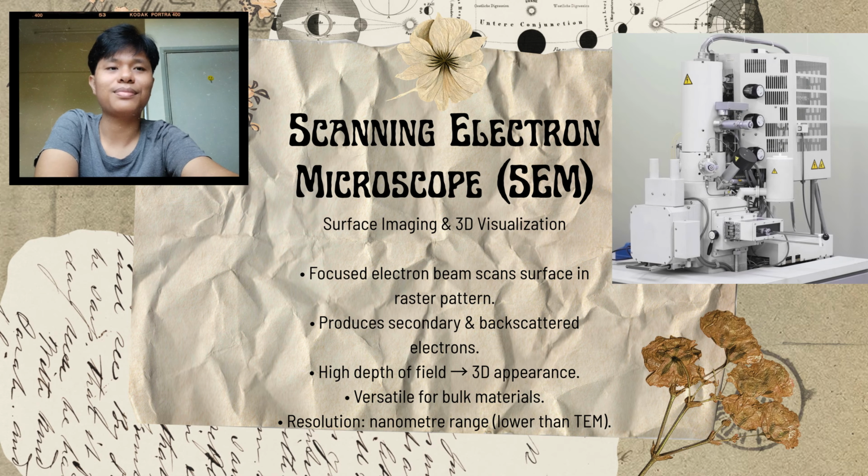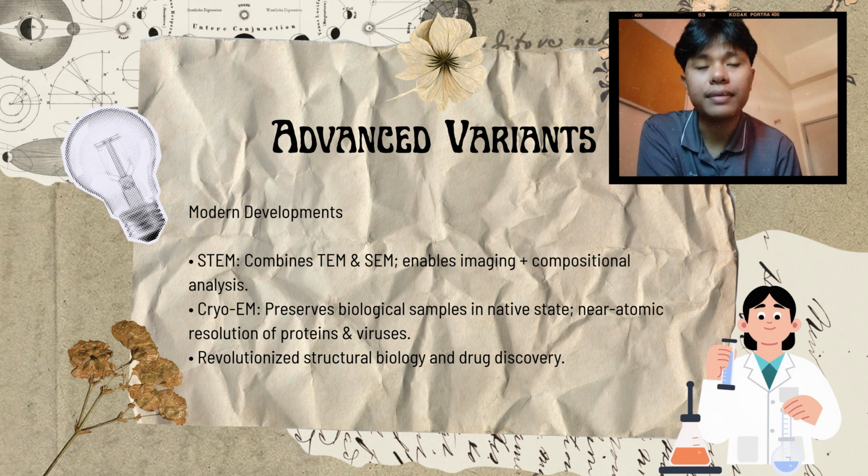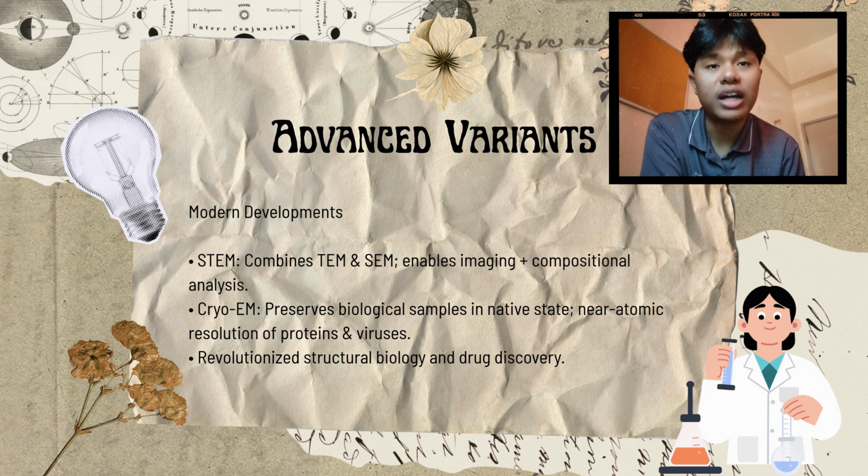electron microscope. There are also some advanced variants or modern developments in the electron microscope, which is STEM, combining the transmission microscope and scanning microscope, enabling imaging and compositional analysis. For cryo-EM, it preserves biological samples in their native state, with near atomic resolution of proteins and viruses. The microscope can also revolutionize structural biology and drug discovery.